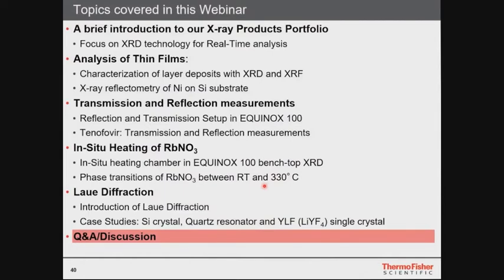So you always have to somehow shape your beam. So in classical Bragg-Brentano instruments, usually you use a filter to get rid of the K-beta radiation, because each of the energies in your radiation will yield a signal.